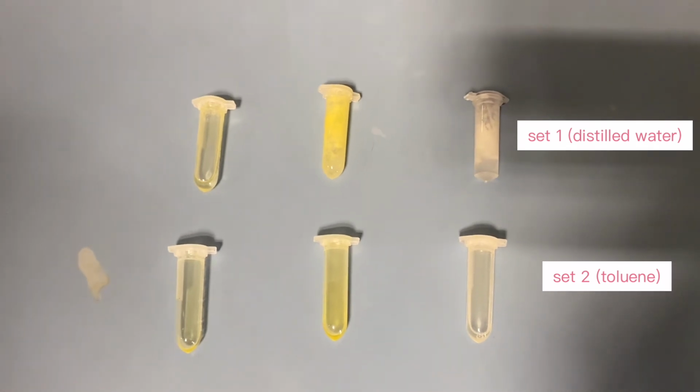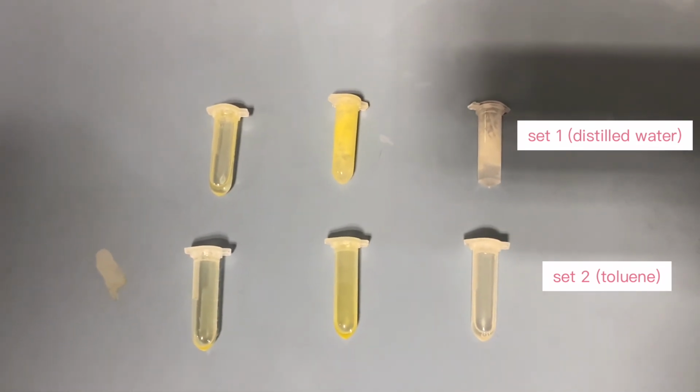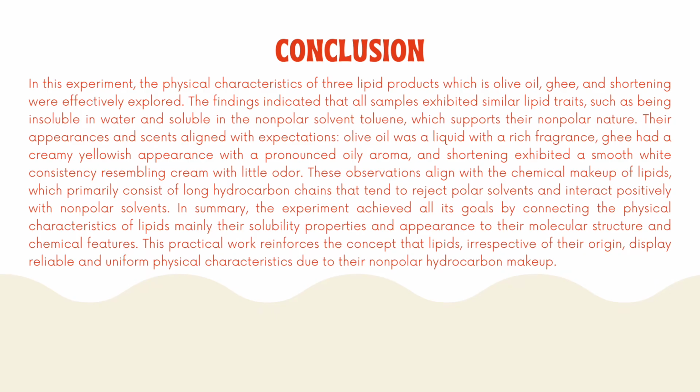So this is the outcome from set 1 and also set 2. So this is the result. As we can see here, lipid is insoluble in polar solvent, meanwhile soluble in non-polar solvent. The conclusion of the experiment.